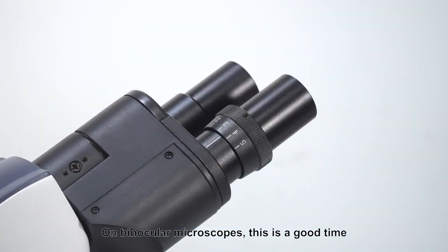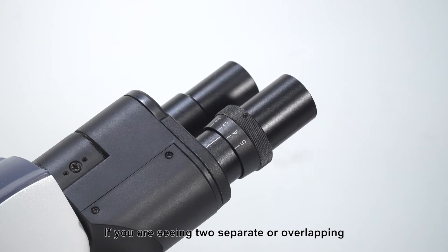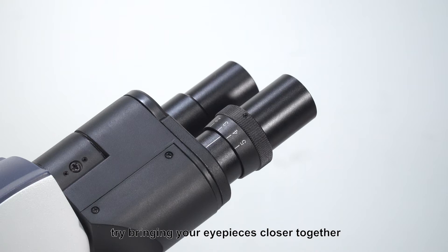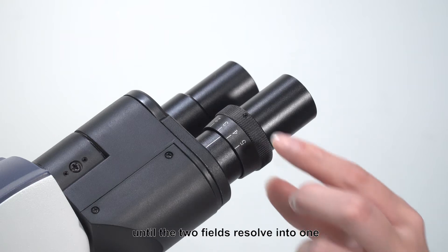On binocular microscopes, this is a good time to check your eyepiece alignment. If you are seeing two separate or overlapping images instead of one circular field of view, try bringing your eyepieces closer together until the two fields resolve into one.